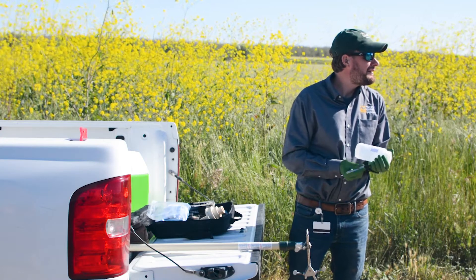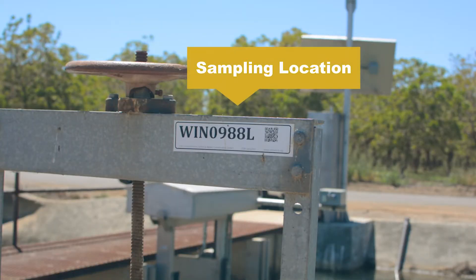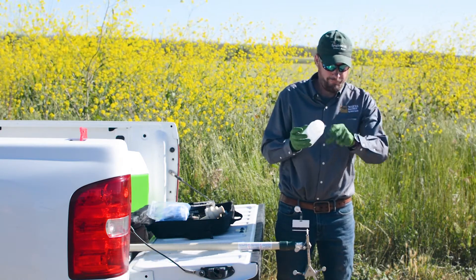Next, clearly label the outside of the sample containers with required information. Include the sampling location, the date, time, GPS location, and initials of the person taking the samples.